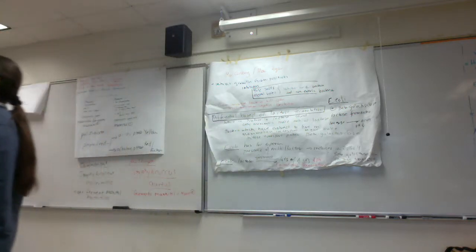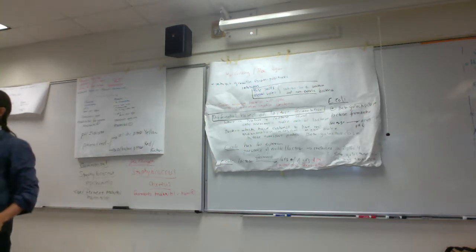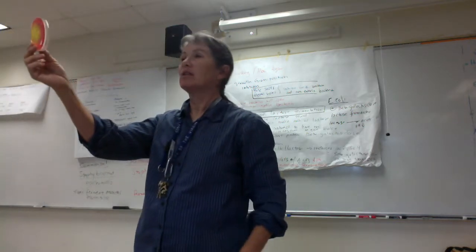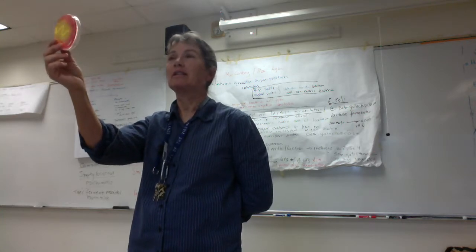Okay, so the agar has turned yellow. Why did the agar turn yellow? The acid pH. Okay, what's the pH indicator? Phenol red, right, turns yellow at acidic pH. Why did we get acids produced? From fermentation of the mannitol, right? And who can ferment mannitol? Staph aureus, good. Does this make sense, you guys?